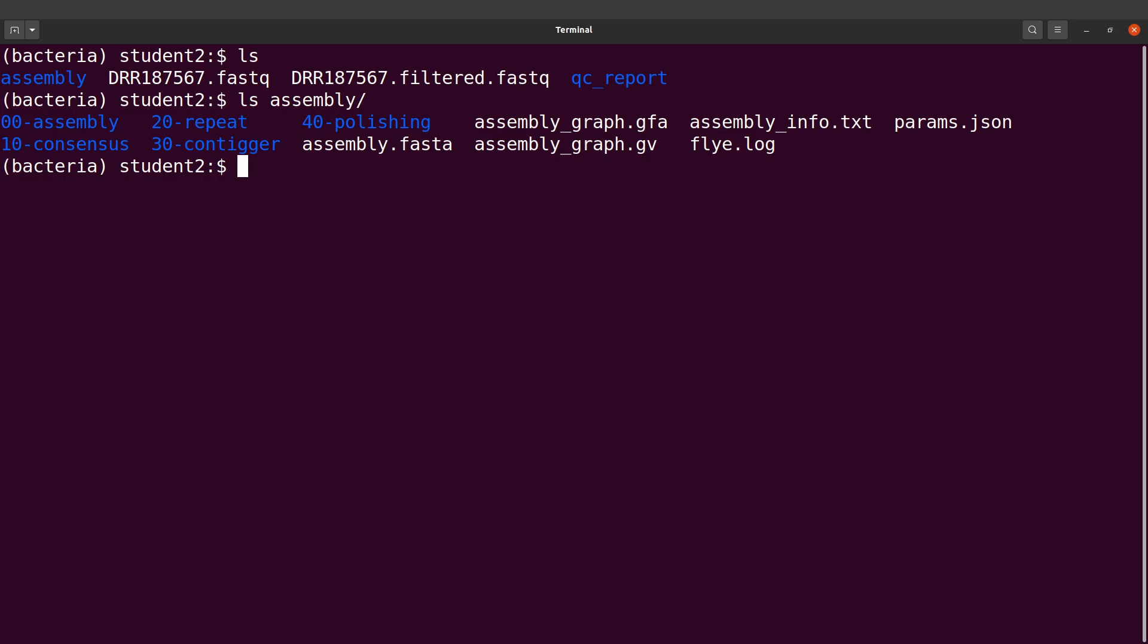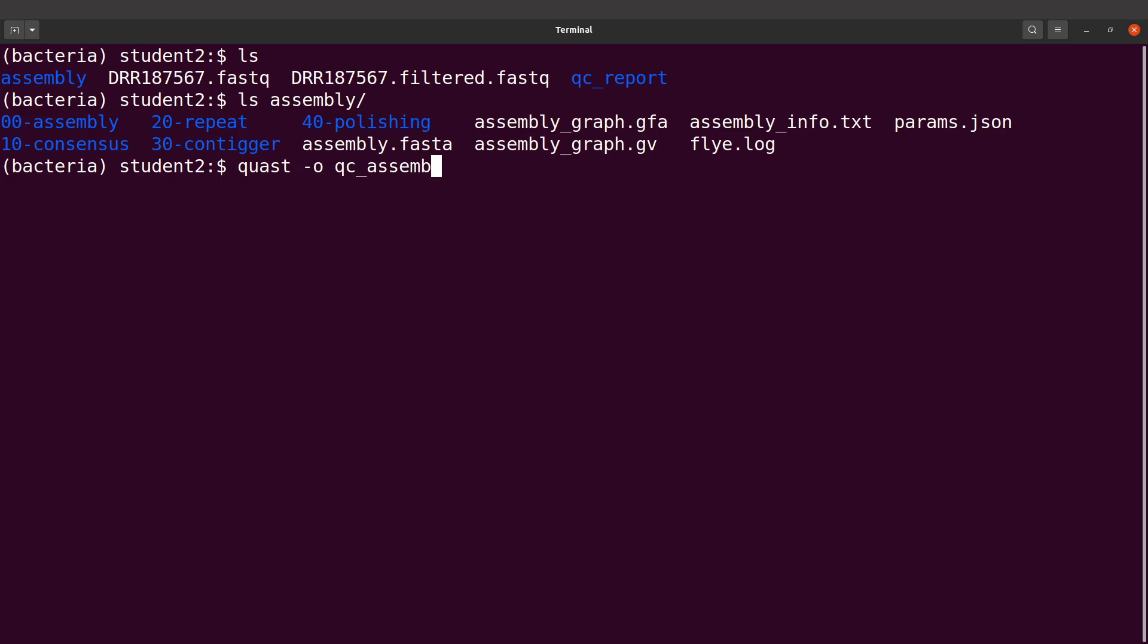To evaluate a genome assembly such as this with QUAST, you say QUAST, and then I will indicate my output directory. I'll say -o and I'll say qc_assembly. This will be my output directory, so the output directory here will contain the output files.